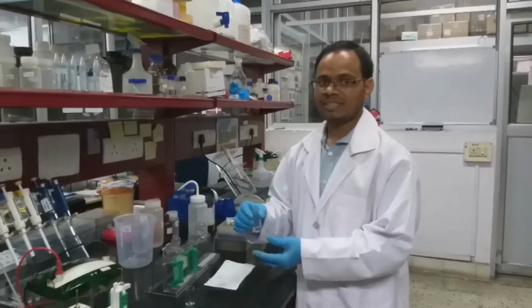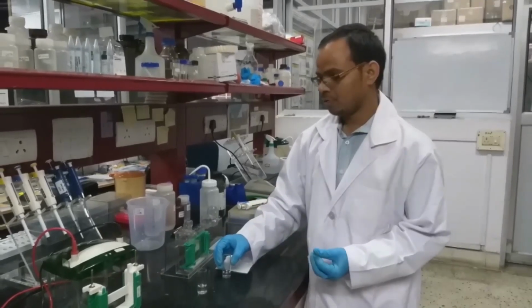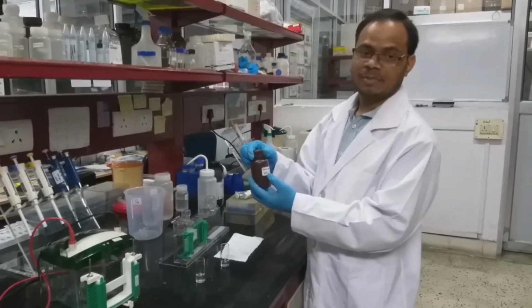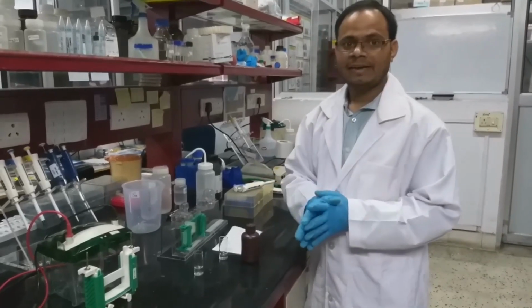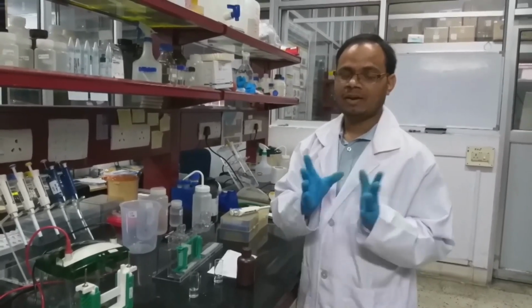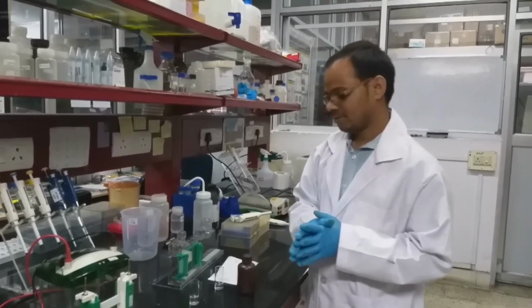I am going to add sequentially 4 ml of water. Now I have to add 3.3 ml of already prepared 30% acrylamide. Already in the introduction I explained how much percentage we have to prepare and how much quantities of acrylamide and bisacrylamide need to be taken.